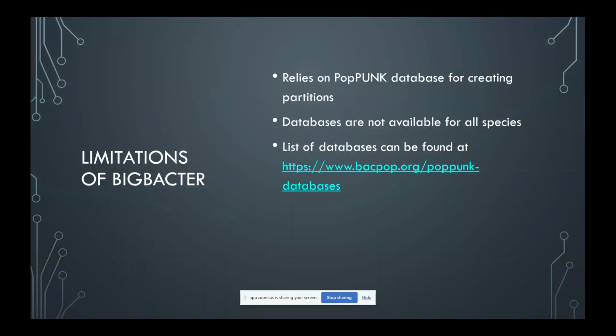There are a few limitations, and the first of these, and I think kind of all of these really, is that it relies on a PopPunk database, and I'll talk a little bit more about what that is in a second. But the PopPunk databases are not available for every species. And a list of these databases can be found at this web address I've linked. If the database exists for the species, this is a great pipeline. If it doesn't, it's a little bit of a headache. I think you can build your own database. I haven't tried to do that, but there are instructions that can be found.